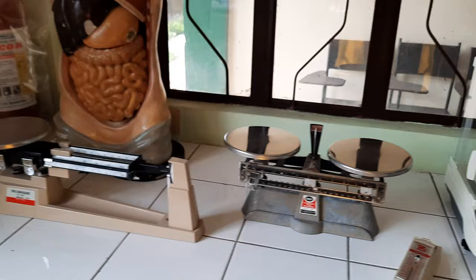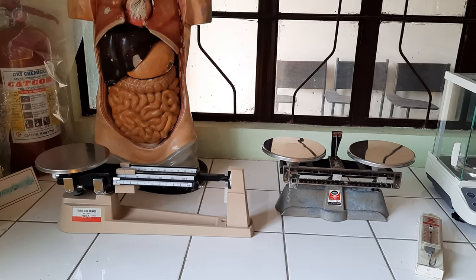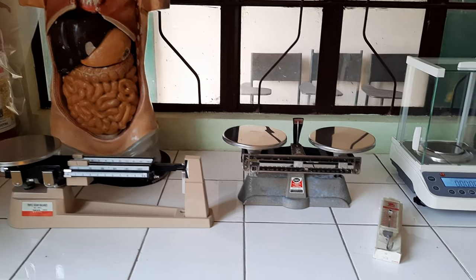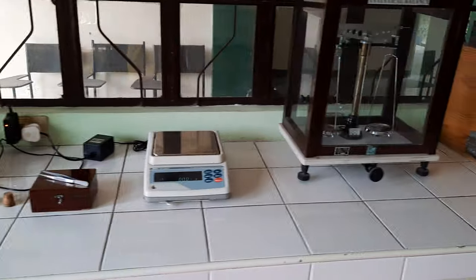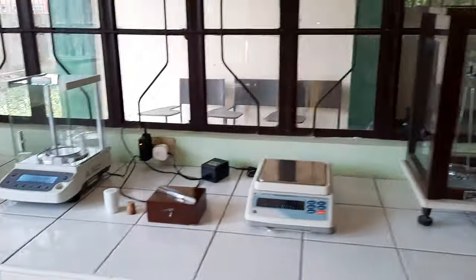Today I will be featuring the different sorts of or kinds of balances that we use in determining the mass of the material or object being studied during experiments or exercises.